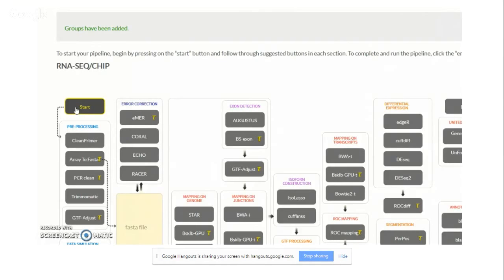So we wanted to help the user move along to creating this pipeline. Also, each time you press a button, you will see a pop-up window where the algorithm is explained, and sometimes you will also have to choose parameters.